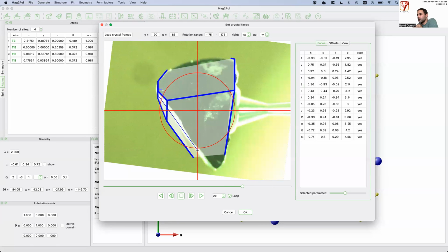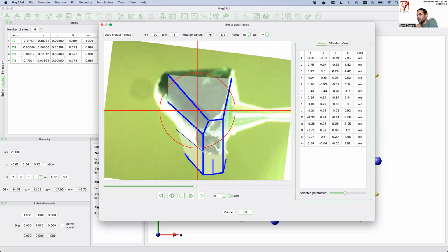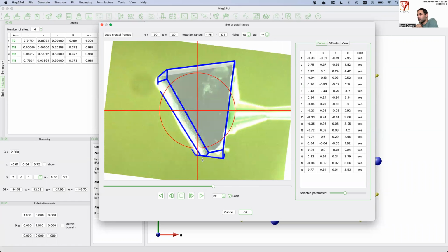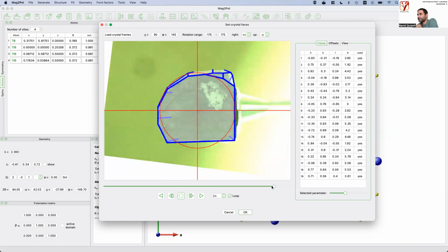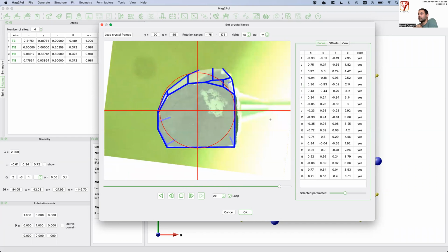Here, there's a lot of volume, which is not true. There's a big chunk over here. Maybe here, but it doesn't need to be perfect. You have more time than me to do it on your own, but this doesn't look too bad. So I can play this.